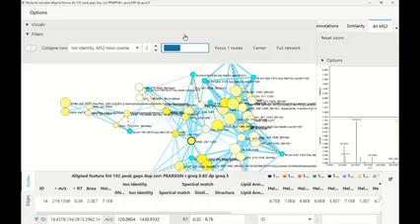Then you could use it while building the spectral library. But it's something we should maybe also include, just adding more mapping. There are great online services that already do something similar, but then you have to do it again, right? There's UniChem, for example, where you can give the structure and get all the different identifiers from different databases.